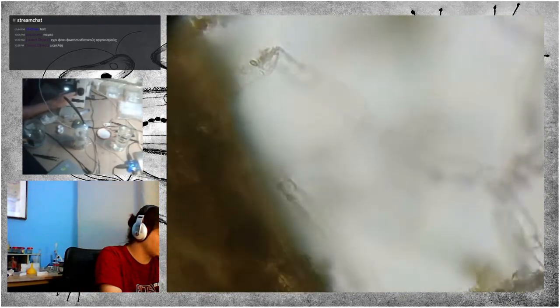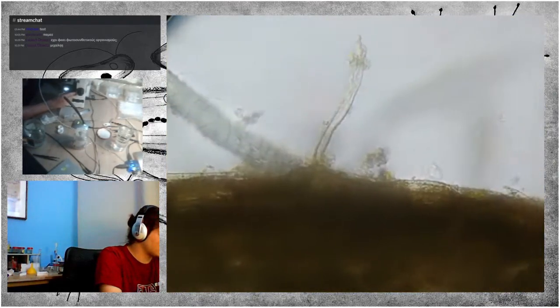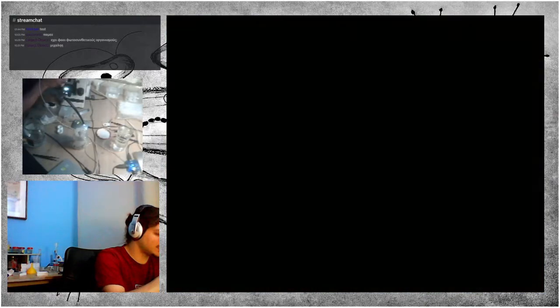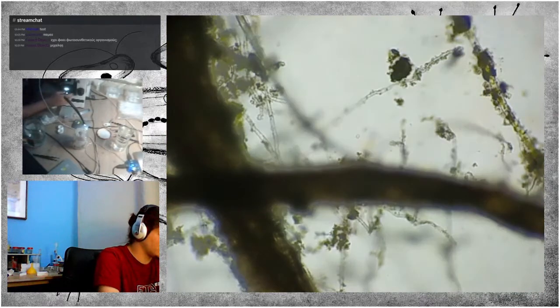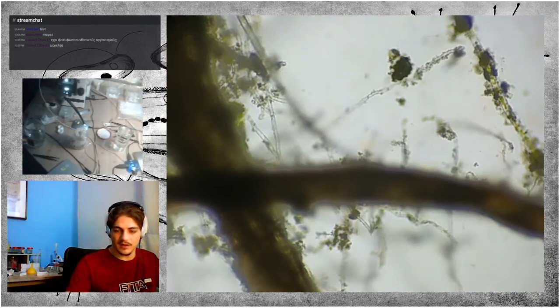And we're just about to close an hour, so let me check real quick. Let me change magnification again. Now we're up to 100. Let me open the condenser.